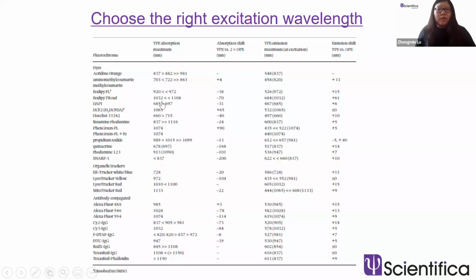Of course, if you're considering multi-color imaging, you have to have the information about the excitation wavelengths, emission wavelengths, all this information, so that you can choose wisely and also take full advantage of the multicolor detection unit I just talked about, the Chromoflex modular.